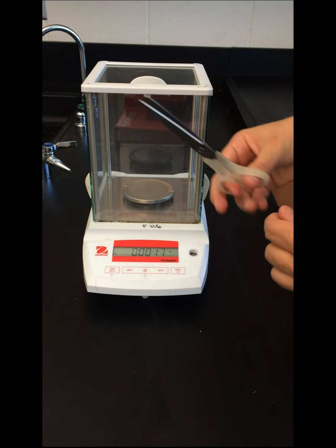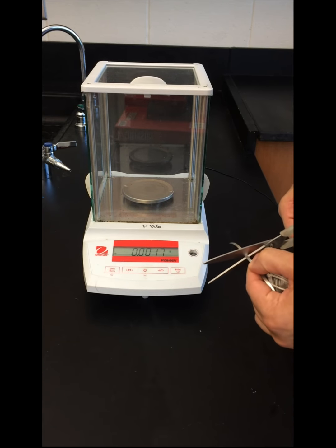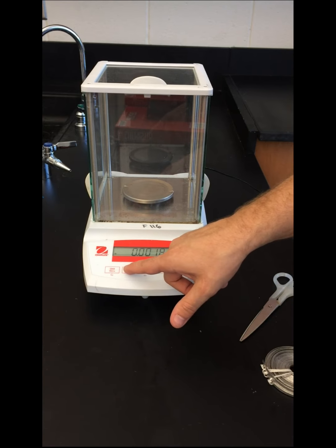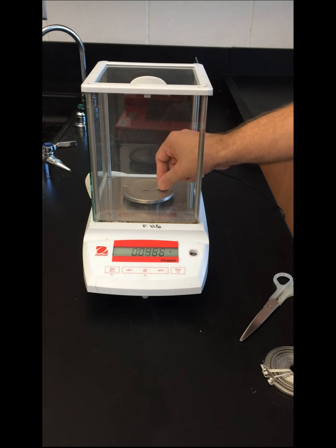Next, we're going to need a piece of magnesium. The magnesium needs to be between 0.045 grams and 0.05 grams. If we go over the 0.05 grams, we may produce too much hydrogen gas for the experiment to give us valid readings.